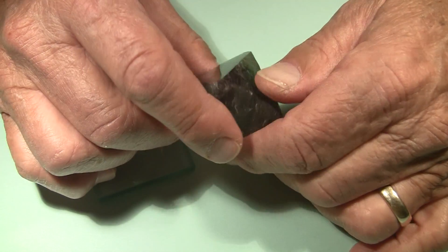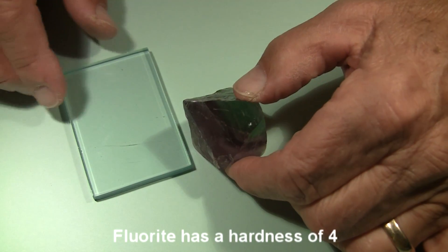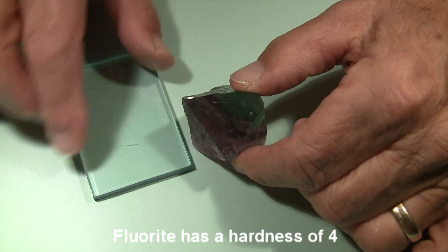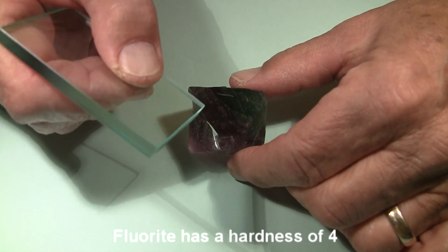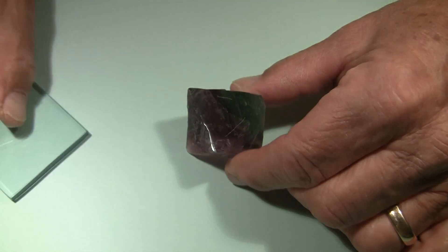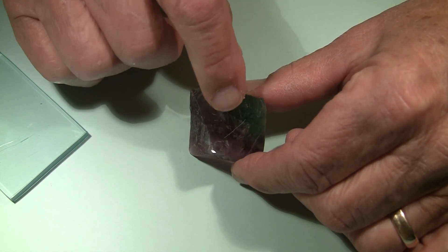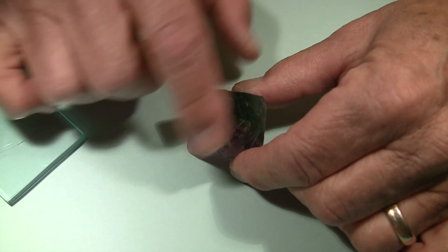I took the time to polish one of the faces here so I could test it more easily for hardness. This is the face here. I'll take the piece of glass, rub it across the surface, and see if it scratches it. Well, as you can see, it left a nice white line that is definitely a scratch.